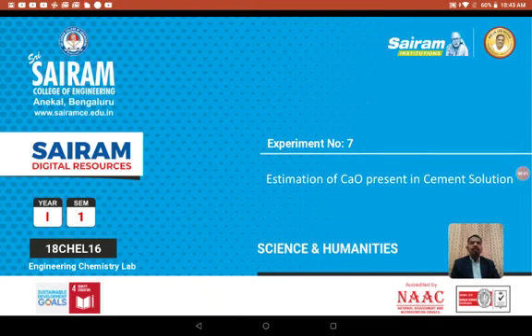Good morning. In our previous experiment, we discussed how to estimate the total hardness of water. Today let us discuss how to estimate the percentage of calcium oxide present in cement.